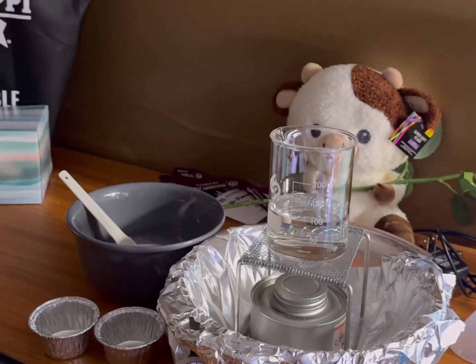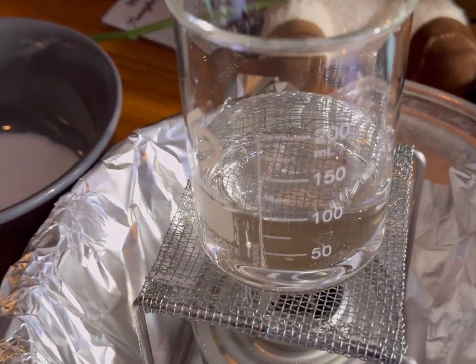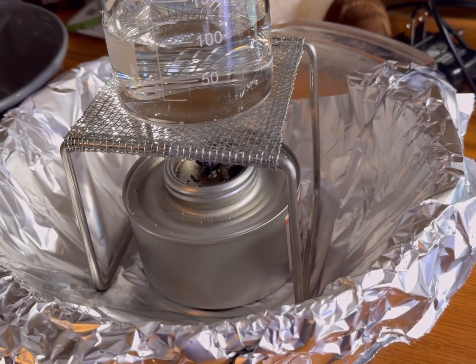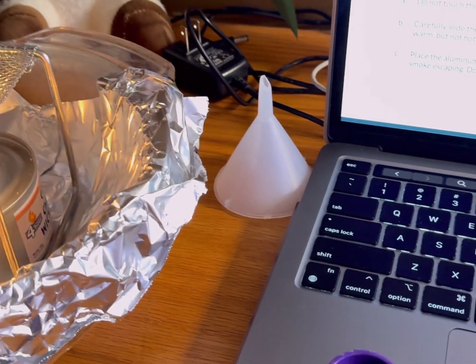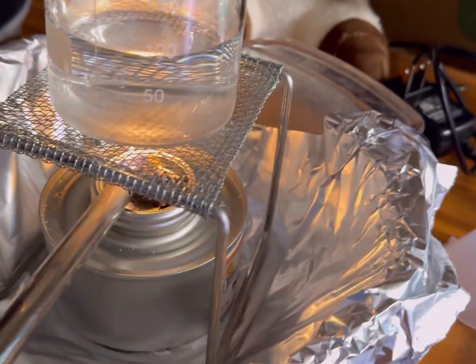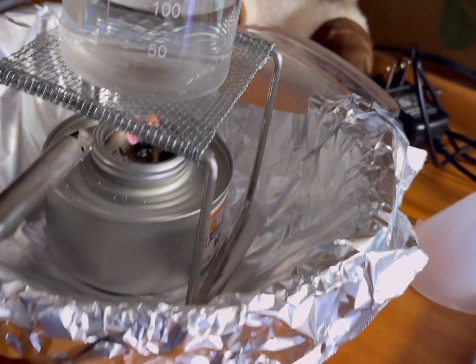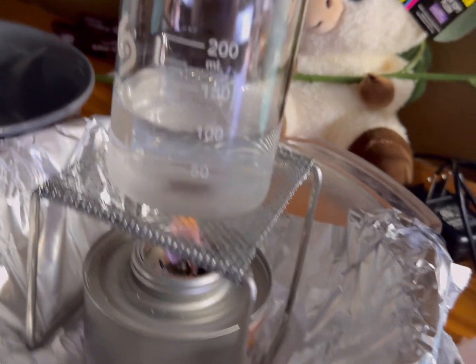And this is the setup for exercise 3. So what we're using, the solution is pure water, and we'll be testing the boiling point of this pure water. So here we go. And we'll wait until the water starts boiling.